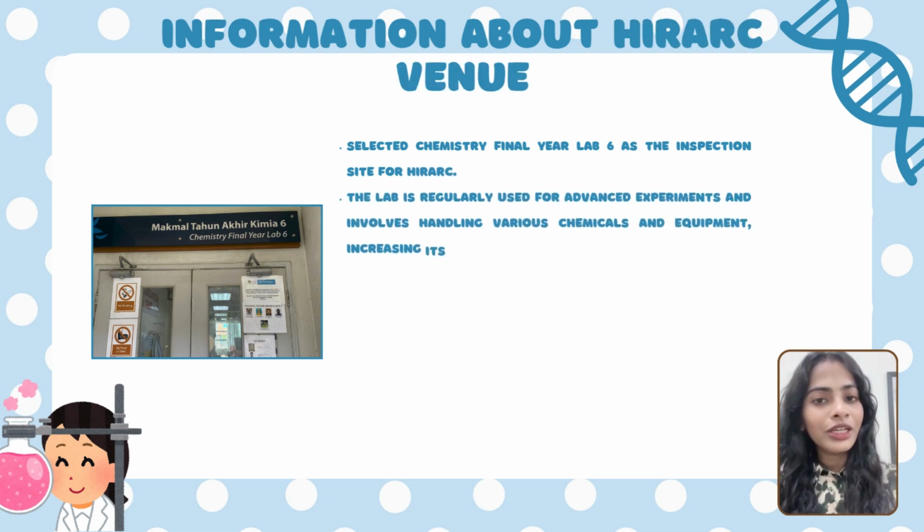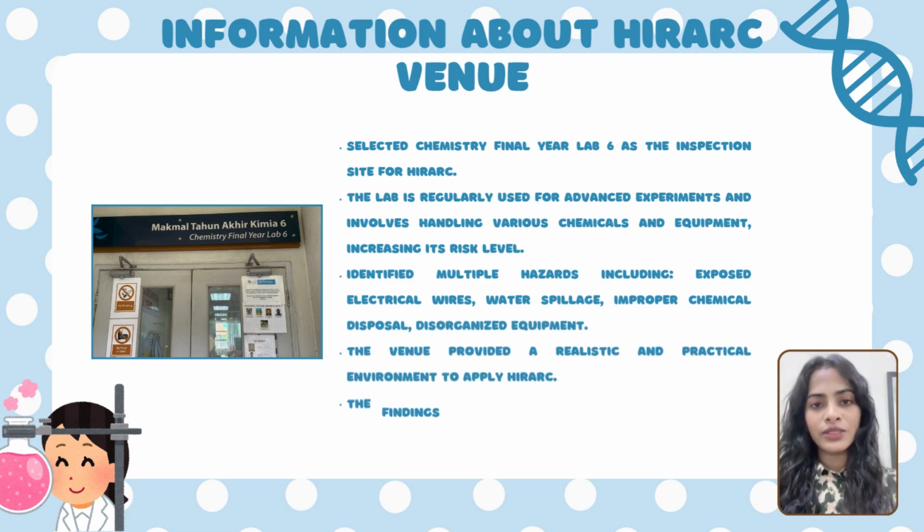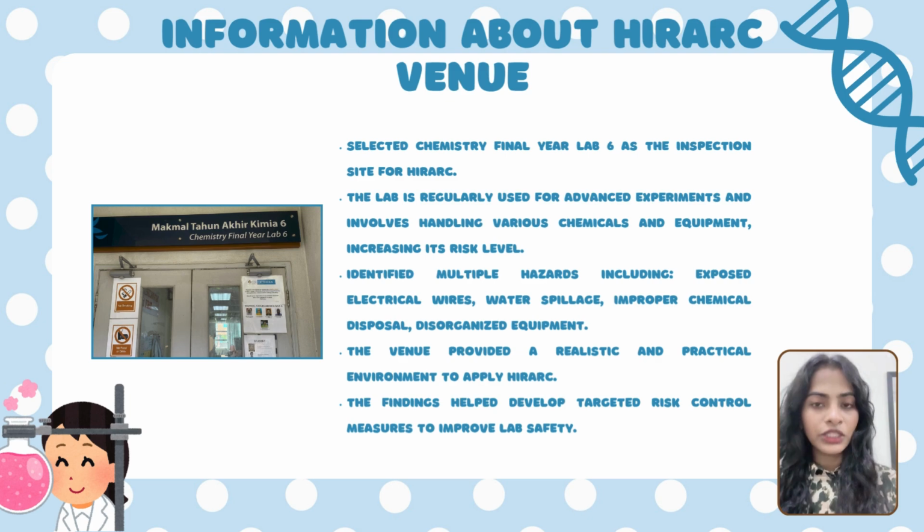I am Subhashani here. I will be explaining the HIRARC venue that our group chose. For our HIRARC inspection, we chose Chemistry Final Year Lab 6 at our university as the venue. This laboratory was selected because it is frequently used for advanced experiments and handles various chemicals and equipment, making it a high-risk area.